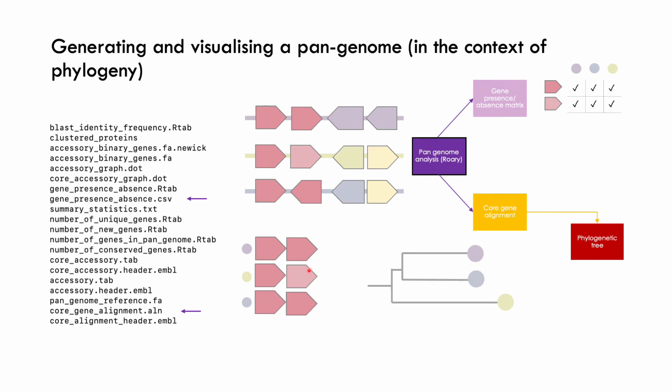But because this second gene in the green genome has some SNPs, it would branch distinctly on a slightly longer branch away from the other 2 genomes. So again, this is just to show one of the ways that you can construct a phylogenetic tree and what this might actually mean.